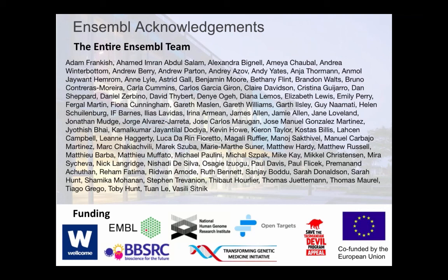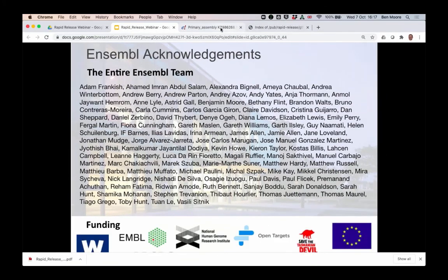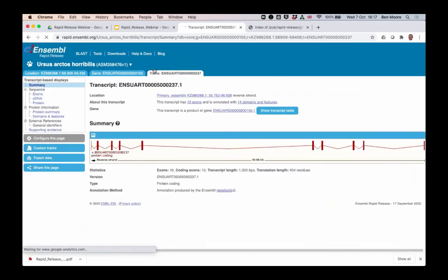So what I'm going to do is just minimize my presentation and go back to the Genome browser. So we can do that perhaps from the Transcript tab. This is the Transcript tab.